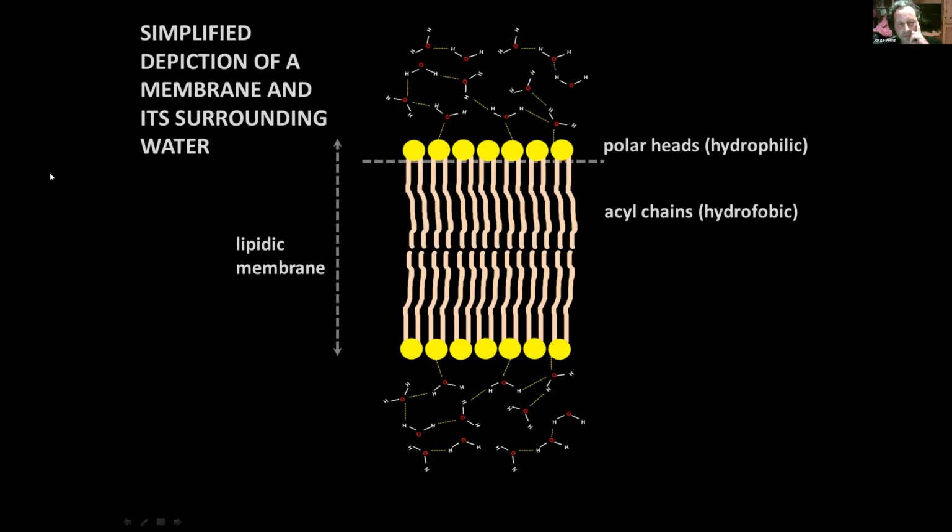I want to show you an approach that I started a few years ago, around 3 or 4 years ago, with near-infrared spectroscopy to study the water surrounding membranes.